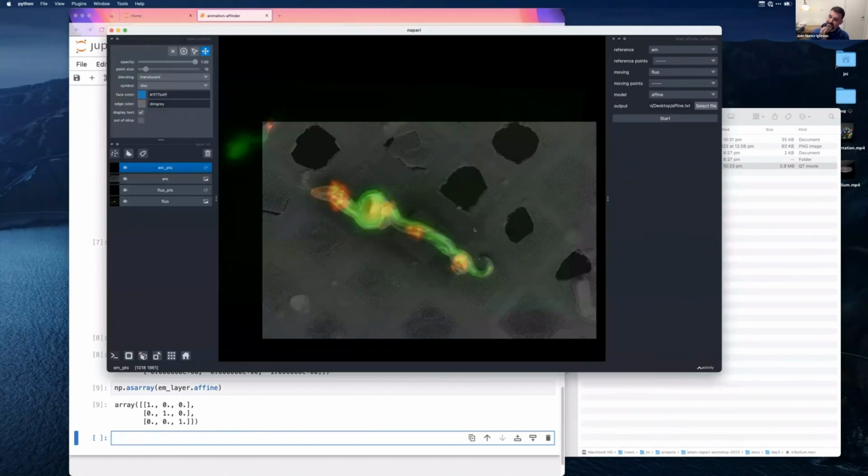I want to add 2 things that aren't here that I want to add in the very near future. The first one is that this works in 3D, but Napari doesn't work very well in 3D because to add correspondence points, you have to be in 2D mode to pick the points. And in 2D mode, Napari won't show rotations that are external to the plane that you're looking at. So if you have a volume that's here and the next volume is rotated 90 degrees in this direction, Napari can't handle that. So you won't be able to see your rotation as you're adding the points.